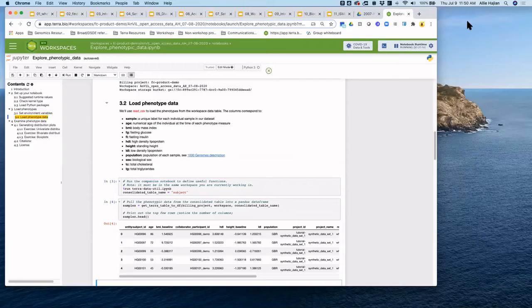I'm getting an error when I'm trying to run the third. Yes, the third one creates an error of file not found. Oh, you know what? I just realized. Okay, so file not found. What's that?